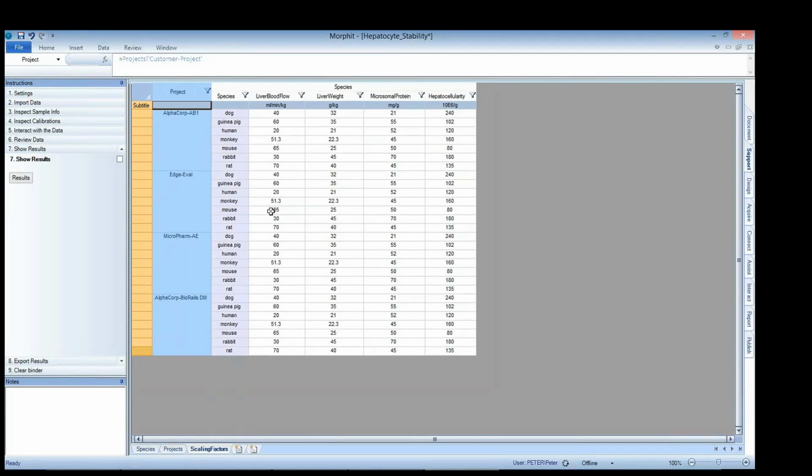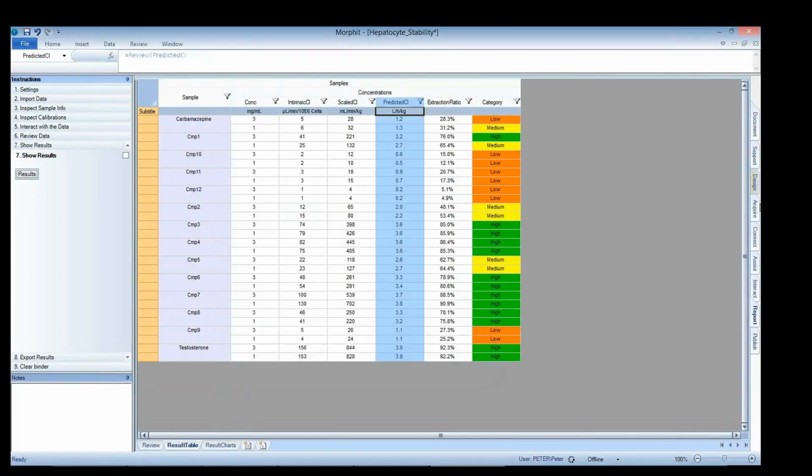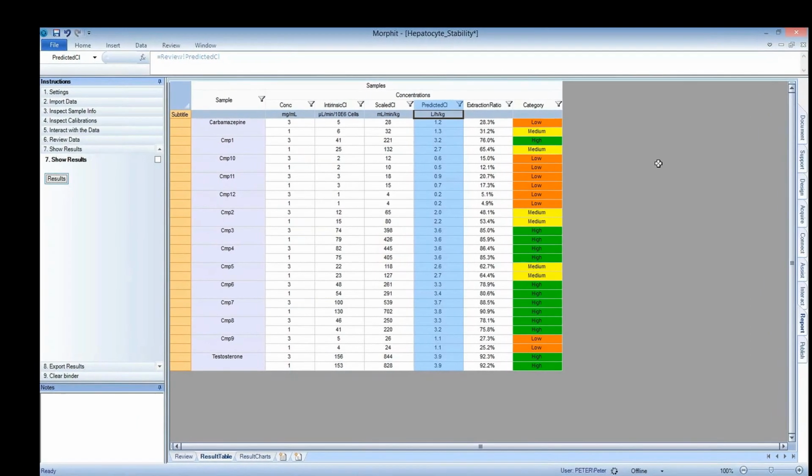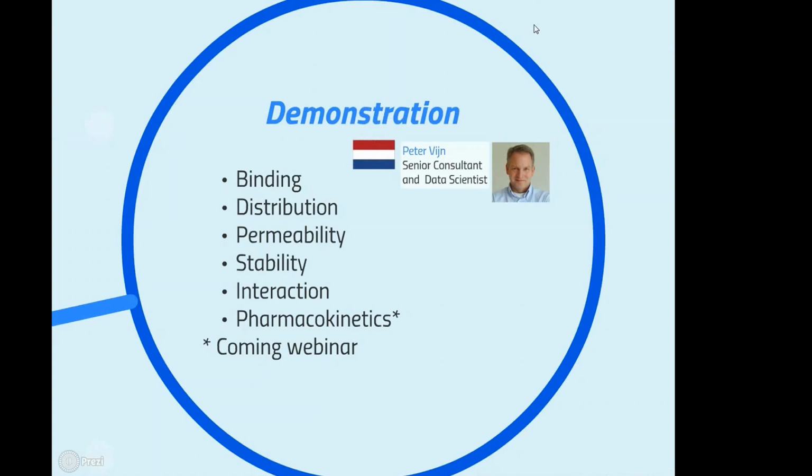Thank you, Peter, for that very comprehensive review of those binders, which I hope everybody found interesting. So some of the benefits of this, first of all of these binders that we've shown you, they all come with full documentation. They've all been through quality control, so they're clear and understandable, they're robust. They're all workflow driven, so they're easy to use, so that training barriers are low. They've all been scientifically validated.